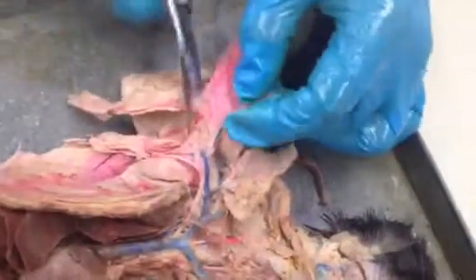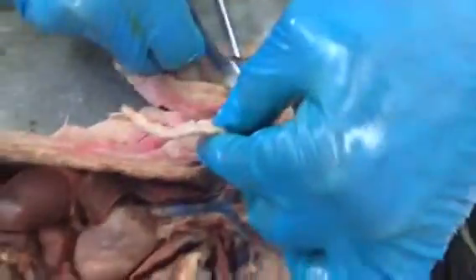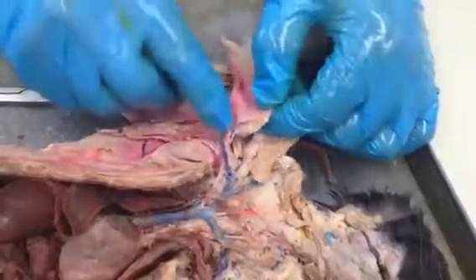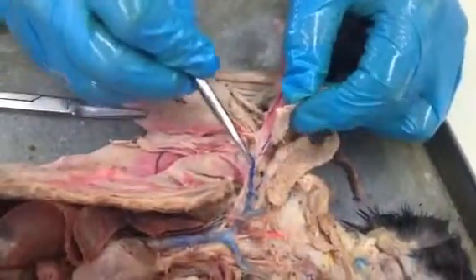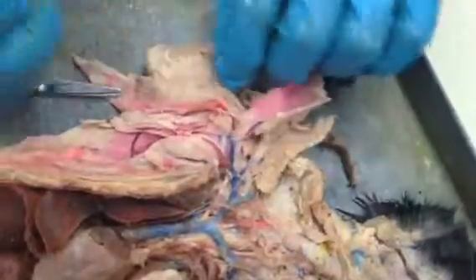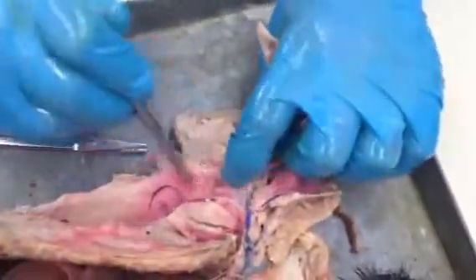And then we have the long thoracic, which is next. That's this vessel, and there should be an artery paralleling that. There is, off of the axillary artery. And then we get out onto the arm and we have the brachial vein.